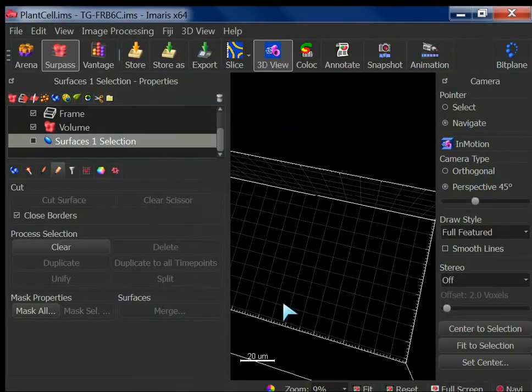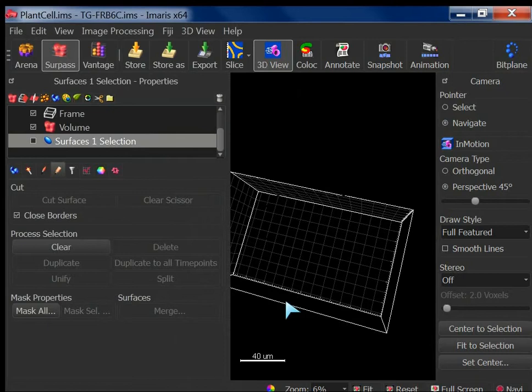Also, sometimes it makes sense to have a binary mask. What if you want to apply a mask on some other channel just to create a region of interest, instead of going and creating a region of interest? Like for example, I will tell you a scenario. The image I showed you for the CPR image has DAPI staining and then there is foci.